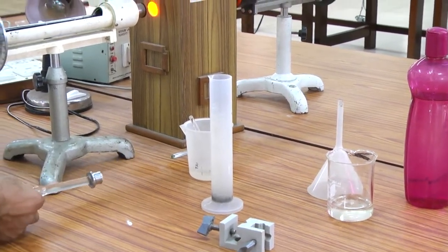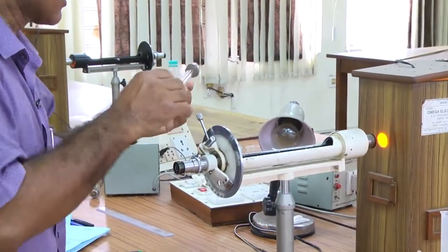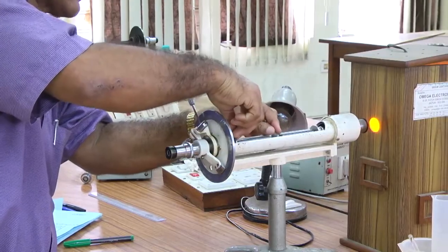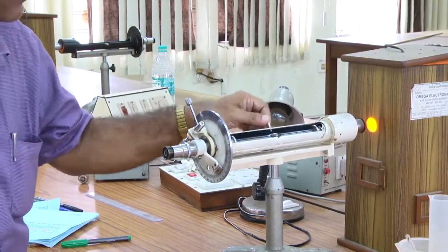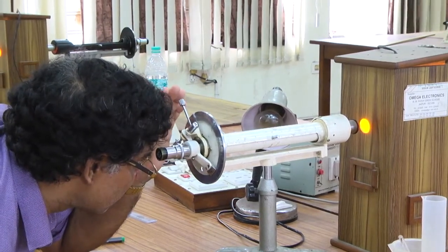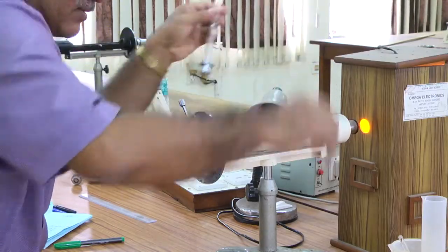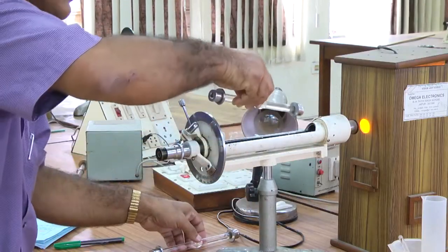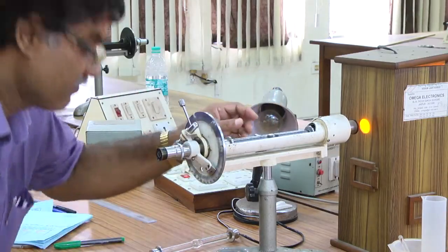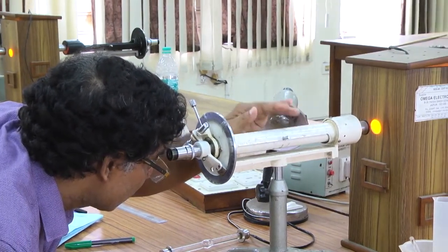So, this is the solution as I told. Yes, which one is the solution? I got confused, but hopefully this is the one I have taken in my hand. So, you put this solution, okay, close it, and now try to find the uniform illumination, but it looks uniform in the same place. So, I think it may not be the sugar one. I think this could be the sugar one. Anyway, yes, it has changed probably. Yes.